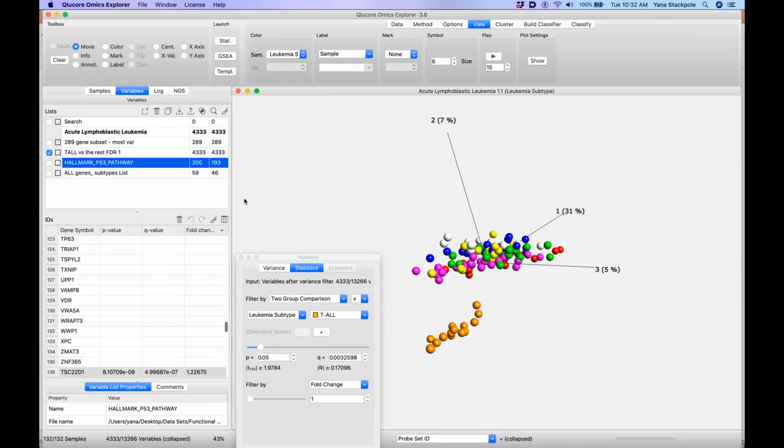So the difference is, when you run GSEA with your data, you will often have 50, 100, 150 sets enriched to different degrees. And then you will be looking at functional meaning and how it relates to your project to pick. And that's something where only the project owner, the researcher involved in the project, can make those decisions intelligently, as you need to know a lot of background.